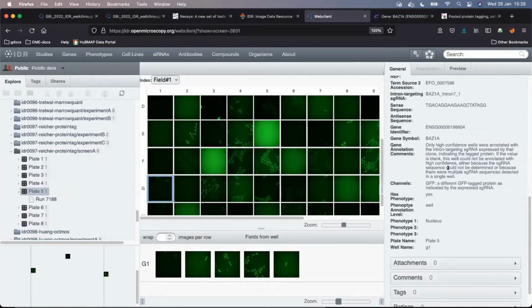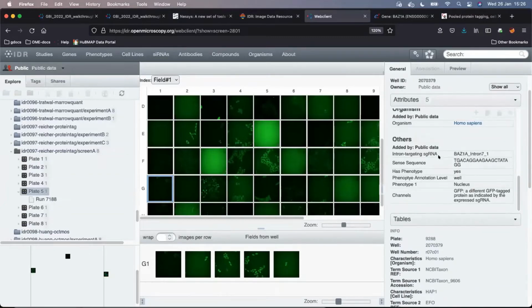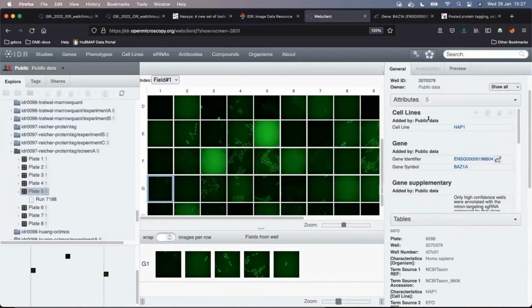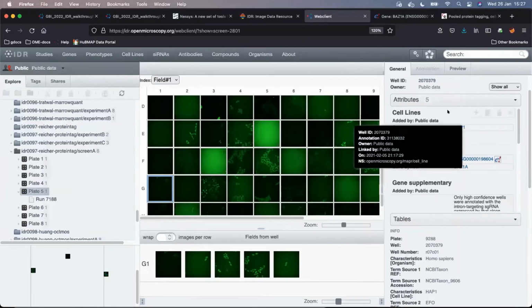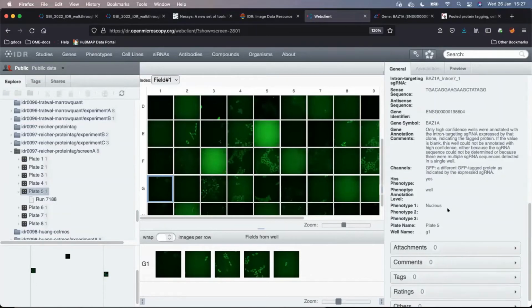And this is basically then turned into this small table appearing on each well. And then we have a script which will basically pick some of those data and display those metadata in this user-friendly manner under the attributes. So the attributes are, so to say, the best of the tables, which are the exhaustive metadata portfolio for each well. Very good.